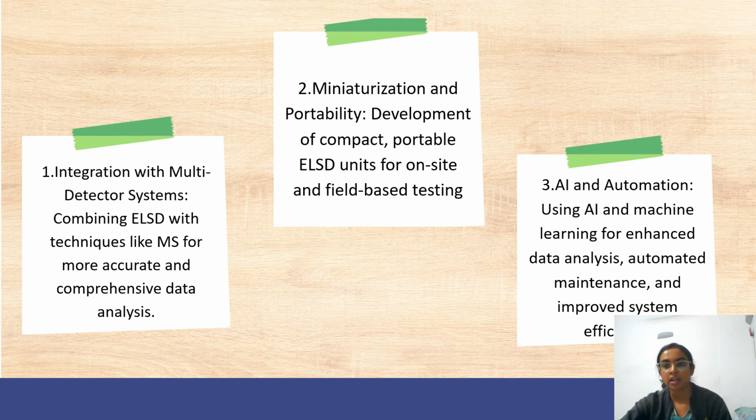Third is AI and automation: using AI and machine learning for enhanced data analysis, automated maintenance, and improved system efficiency.